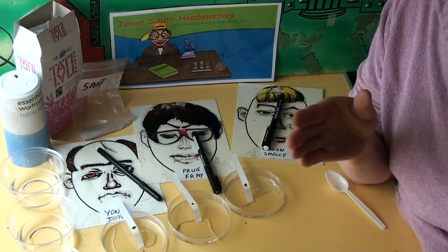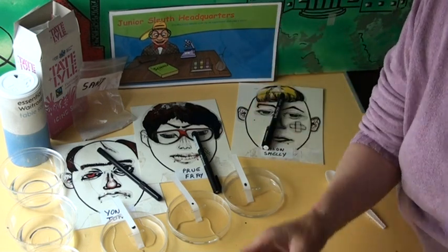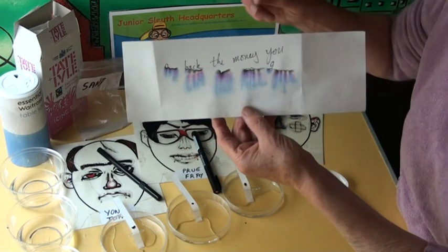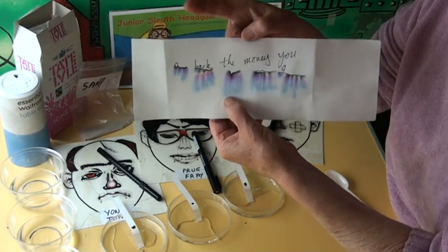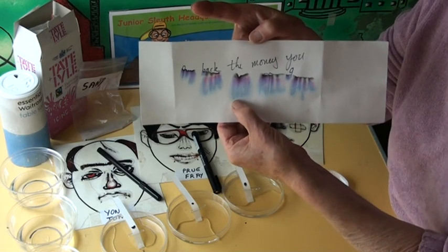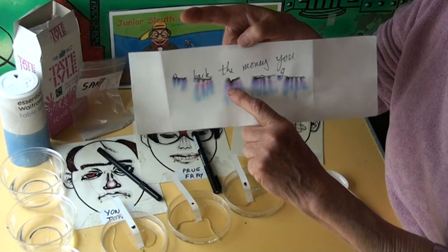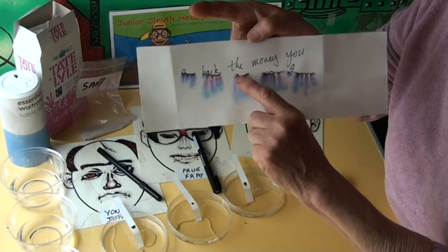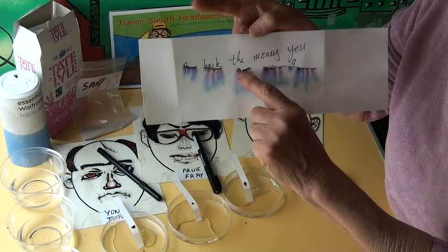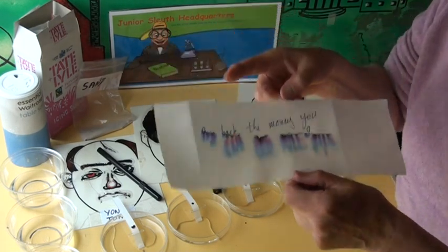The more soluble travel right up with the water and divide, just as it was divided in the note. The bloom from the pigment of the murder pen was only slightly soluble — it didn't move to the top. The red was a little bit more soluble and the green was almost completely soluble. Some of the black hasn't separated yet.